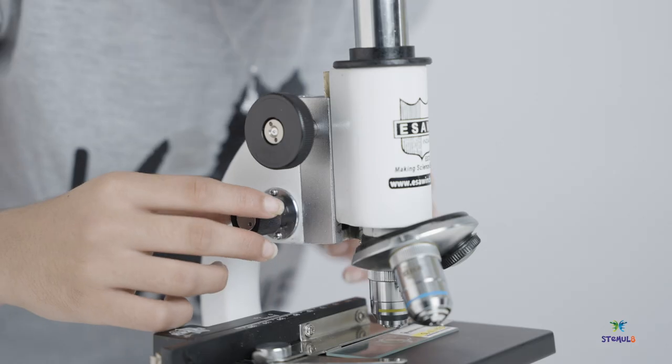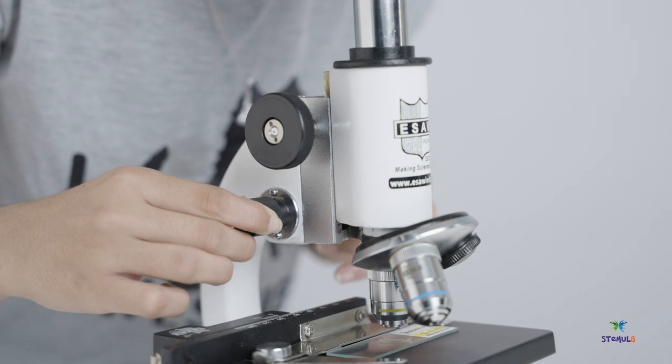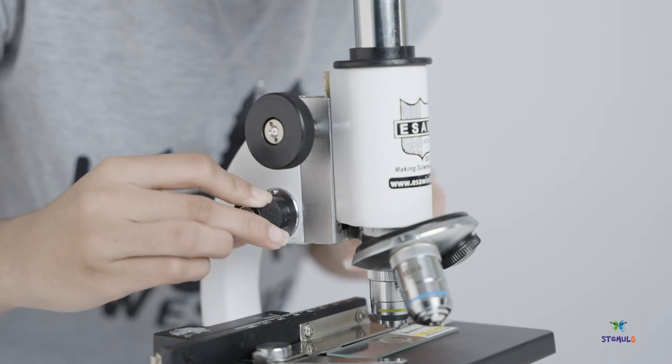Next, slowly rotate the fine adjustment knob, until you see a clear image of your specimen.